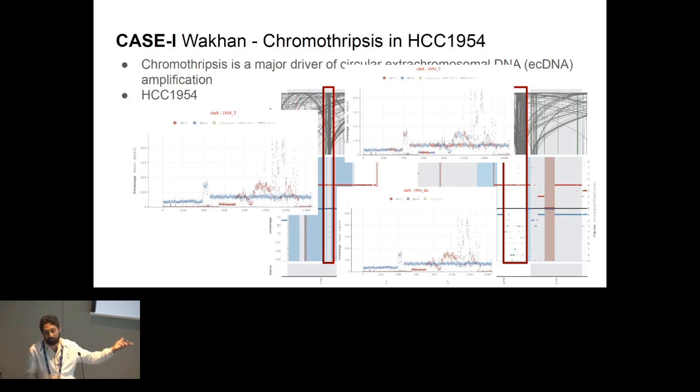In these types of scenarios, all allele-specific tools will struggle because they will assign higher coverage to a major allele and lower coverage to the minor allele. And this coverage profile will fluctuate so much in all these allele-specific methods.